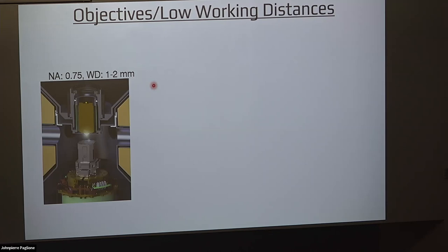I should also mention for microscopy studies that the system is designed to be very low vibration, less than 10 nanometers in any given direction. That's where a lot of the engineering went into this, because you've got this pulse tube cold head chugging away. What do you do to keep those vibrations from making their way to the sample space? That's basically the cold head suspended, et cetera. It's a very intricate system to get these vibrations away from the sample location.